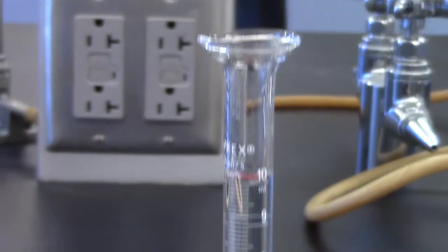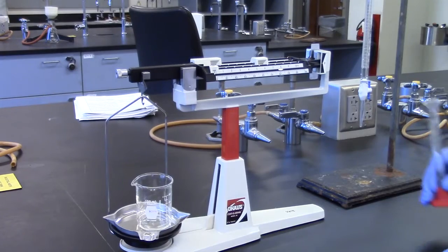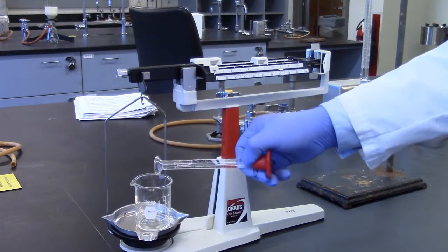Once the graduated cylinder is filled to the 10.0 milliliter mark, transfer to the 100 milliliter beaker and weigh on the balance.